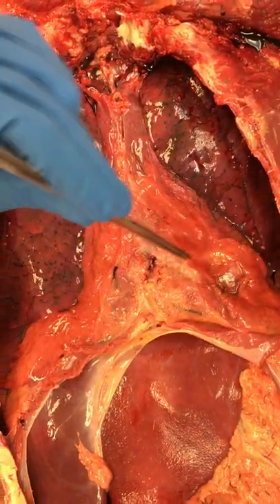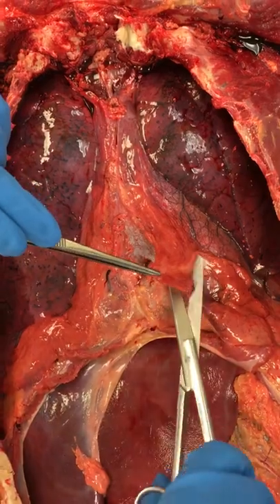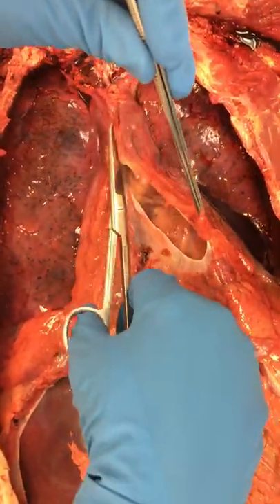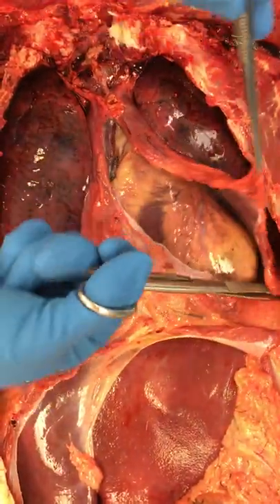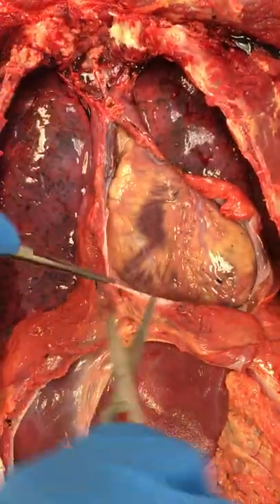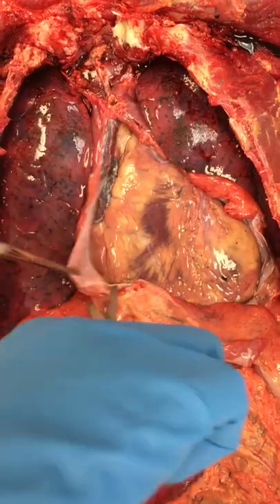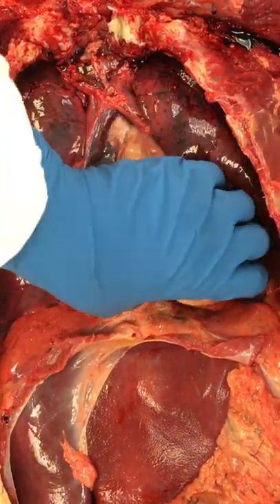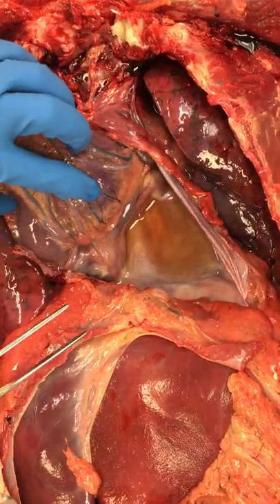Very simply, you grab some forceps and pull up on it and you just open it with the scissors. You go superior toward the head and then toward the apex of the heart and you reflect it back, and then we have the heart.